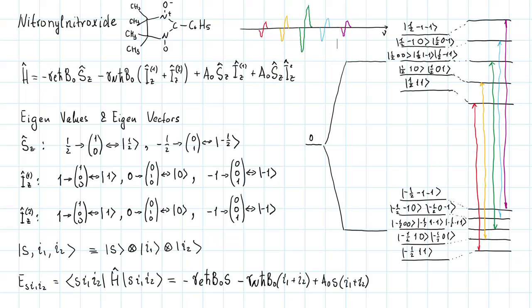Generally, the difference in the line magnitudes is attributed to the interaction of the electron spin with the equivalent nuclear spins. For comparison, in the case of the TEMPO radical, we had interaction of the electron spin with one nitrogen nuclear spin, and it gave us 3 equal lines. If we had more spins in our spin system, we could use the same procedure as described here to explain the major characteristics of its EPR spectrum.